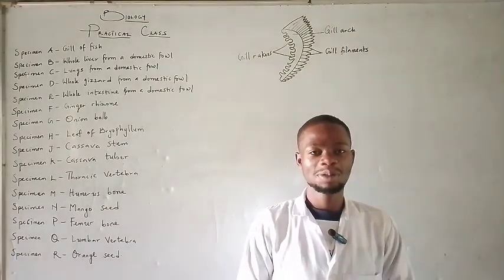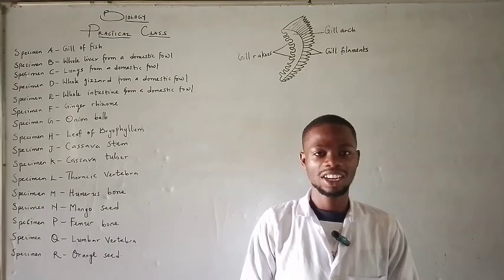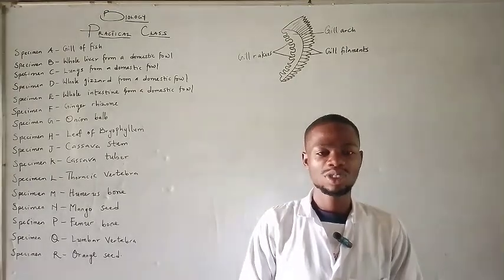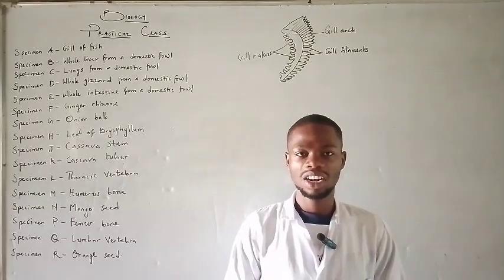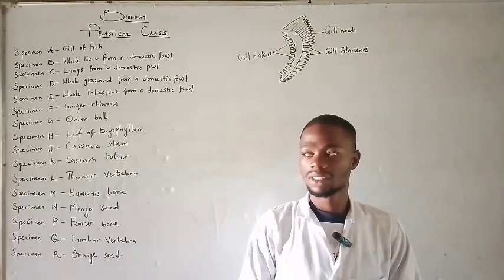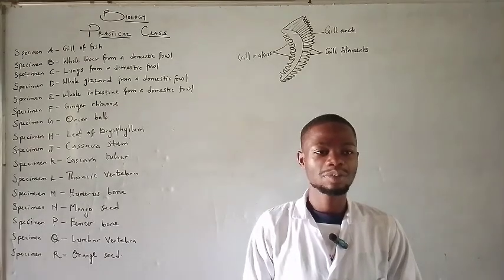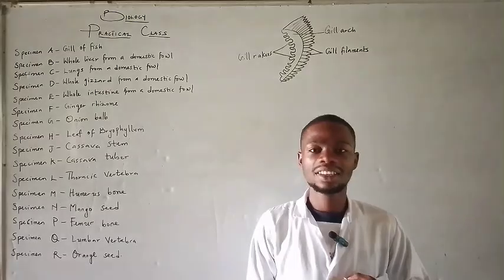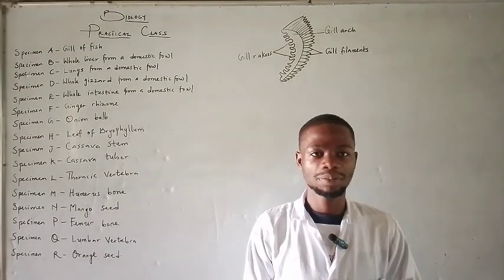Welcome to biology practical class. This class is a preparation class for the WAEC 2024 biology practical examination. We have been given a mandate to prepare 16 specimens. So I'm going to take you through the 16 specimens. Thereafter, we take them one after the other.